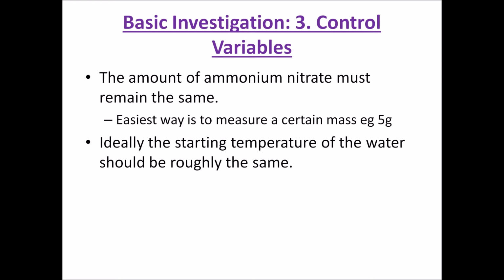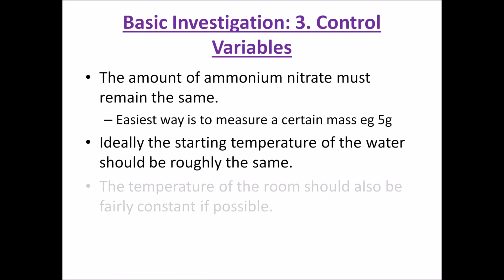Ideally, we'd keep the starting temperature of the water roughly the same. It doesn't have to be exactly the same. If your starting temperature of the water is 20 degrees one time and 23 degrees the other, that's not so bad. If it's 20 degrees one time and 40 degrees the next time, then yeah, we've got some issues. So we're going to try and keep the temperature of the water roughly the same, not exactly.